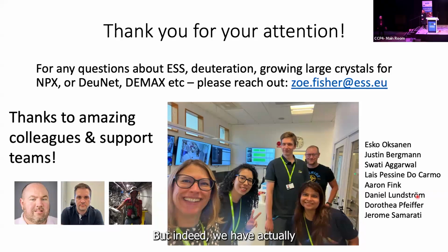But indeed, we have actually a large team of scientists at ESS working on polarization for the other beamlines, including some diffraction, small molecule stuff. And I think we will gain a lot of knowledge in the first years of operation, how that is working out. So we do have the technical expertise at ESS. We are just not yet considering integrating it into NMX, but not to exclude it.